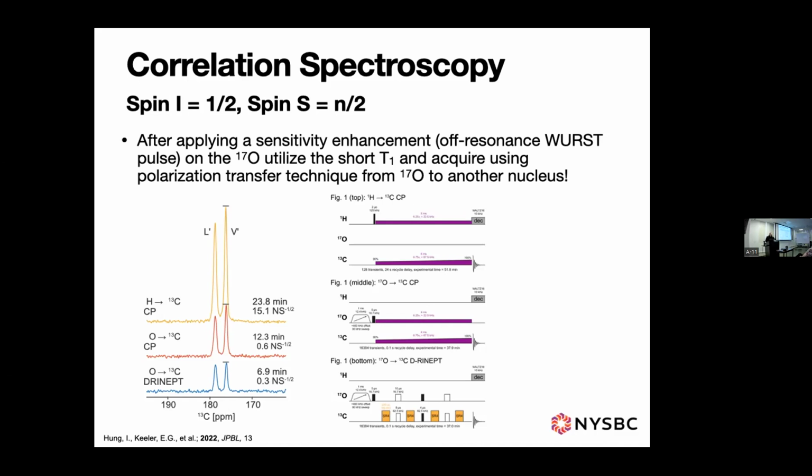So this top spectrum is just proton to C13 CP. So we're just activating the C13s here. We just did proton to C13 CP. That's kind of the standard. We just do regular CP like you would. Nothing fancy about that. Now we do oxygen to carbon CP.